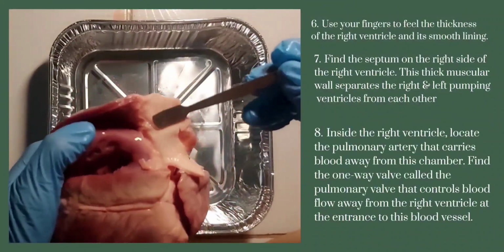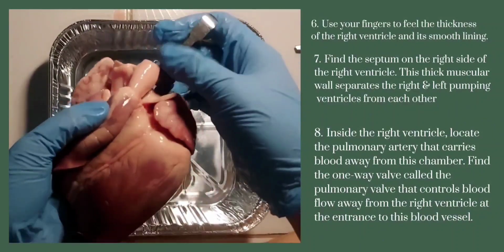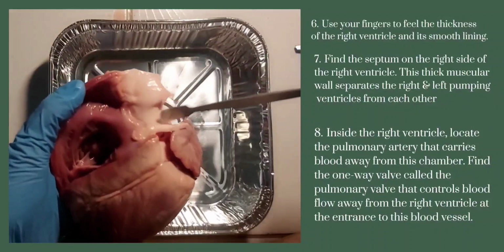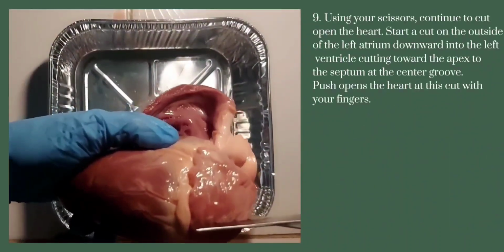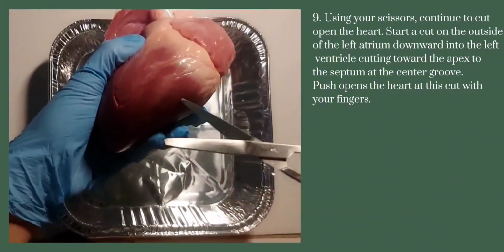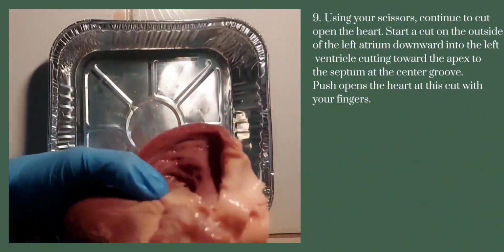Inside the right ventricle, locate the pulmonary artery that carries blood away from this chamber. Find the one-way valve called the pulmonary valve that controls blood flow away from the right ventricle at the entrance to this blood vessel. Using your scissors, continue to cut open the heart. Start a cut on the outside of the left atrium downward into the left ventricle, cutting toward the apex to the septum at the center groove.